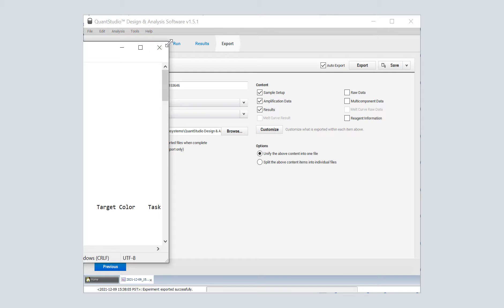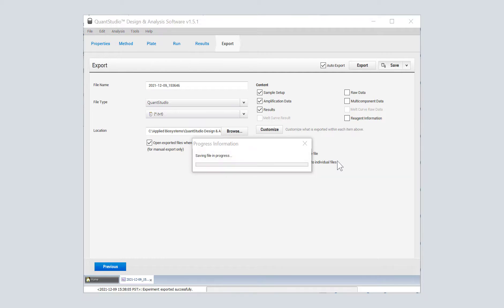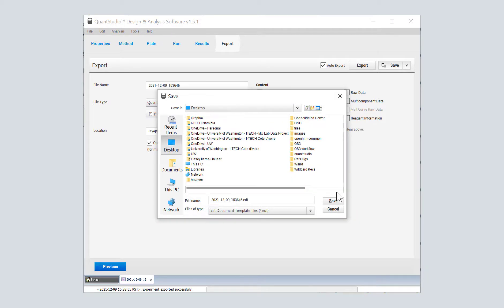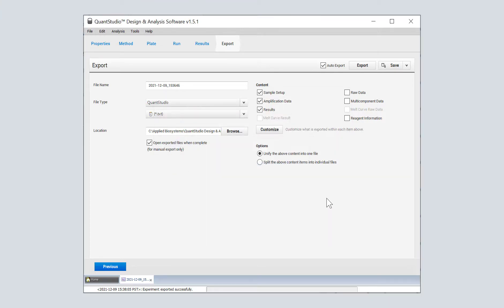After that, we can select Auto Export if we want at the end of running an experiment. We click Save. Again, make sure that that is that shared folder. And that's it. The results will show up now in OpenAlice.